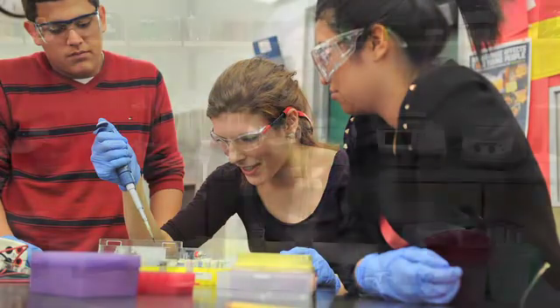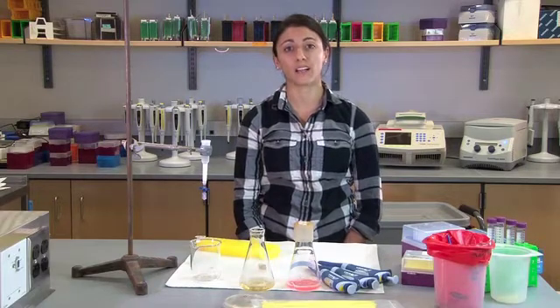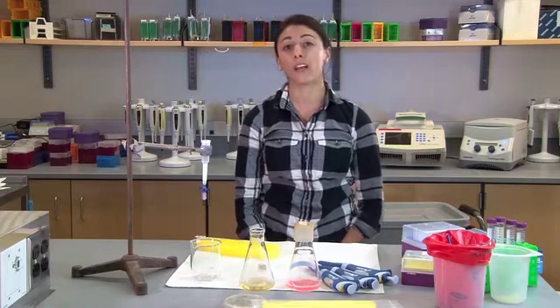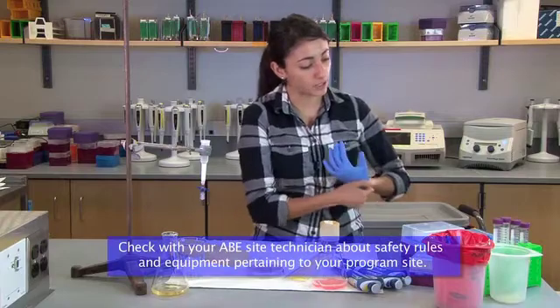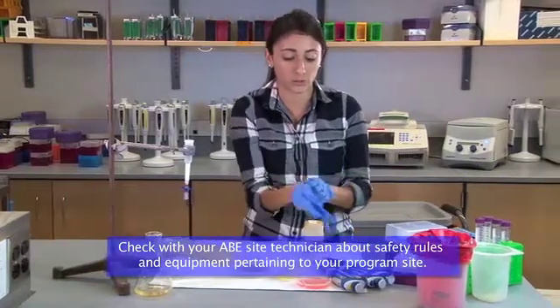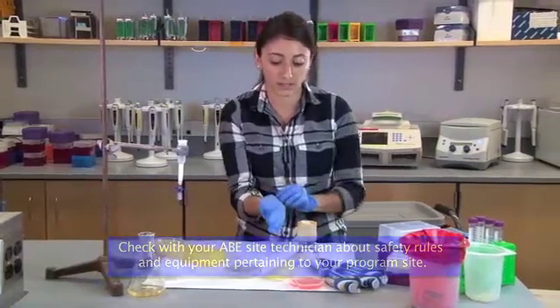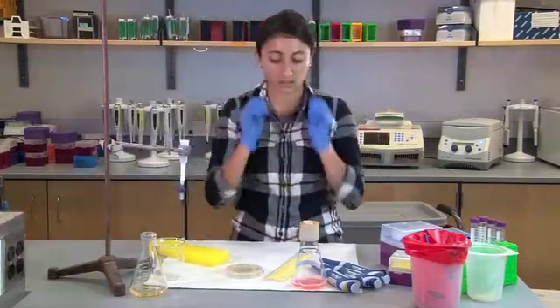In order to proceed with Laboratory 6, you have to start a bacterial culture using the E. coli cells from Laboratory 5 or with provided E. coli cells that have already been transformed with the plasmid. Here at the Massachusetts site, we suggest to teachers to pluck a colony from one of their plates from Laboratory 5. So similarly to Laboratory 5, we want to make sure that students adhere to the proper safety guidelines since we are continuing to use the bacterial E. coli cells. So we want to make sure that students have gloves on as well as their safety goggles.